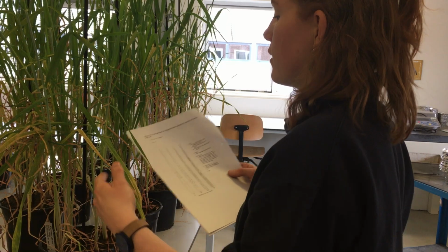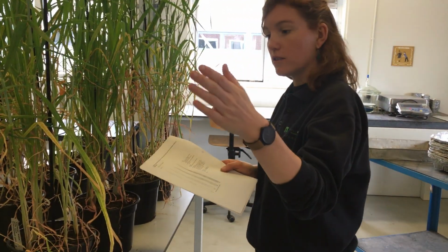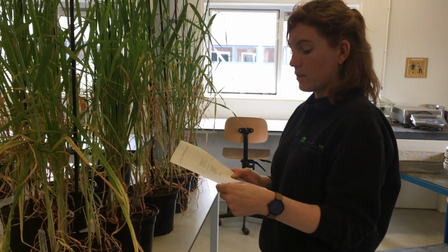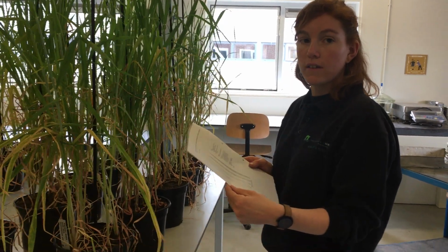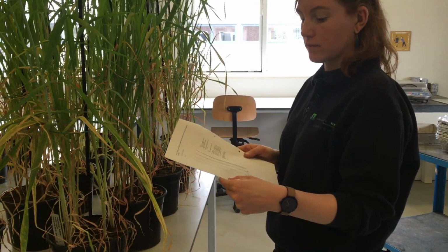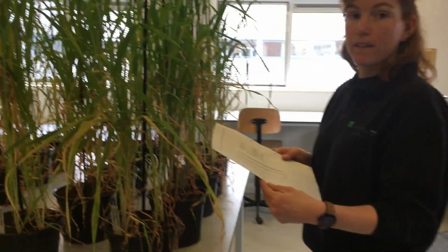That's right, yeah. And one person should take all the measurements, and somebody else should also take all the measurements, and then take an average of the results. That's correct. So it shouldn't be that one student does the first pot, another one the second one. No, that's not correct. So you will score all of them.